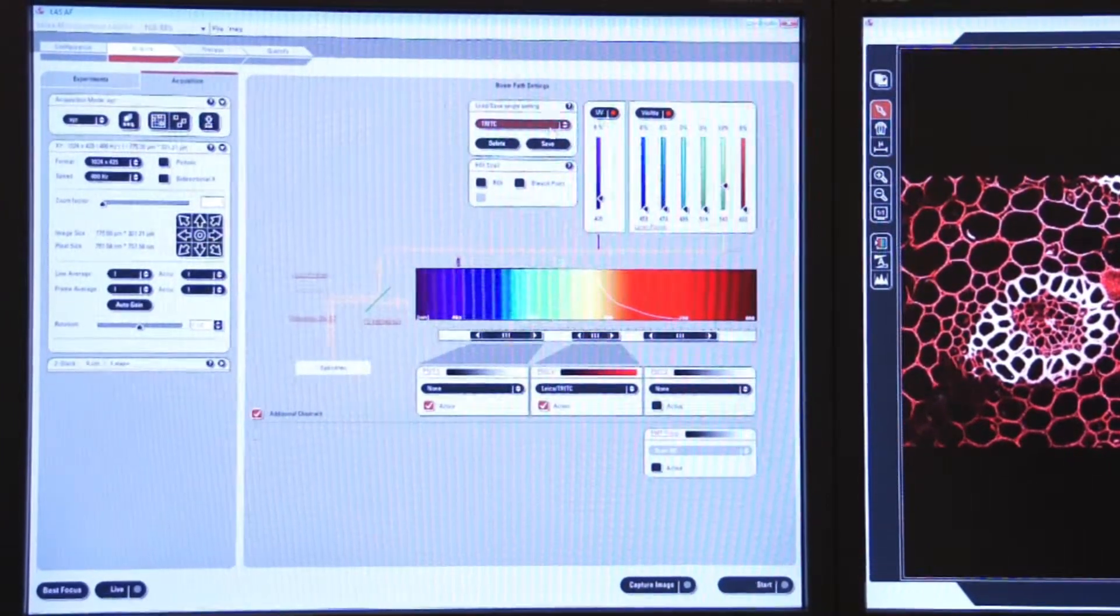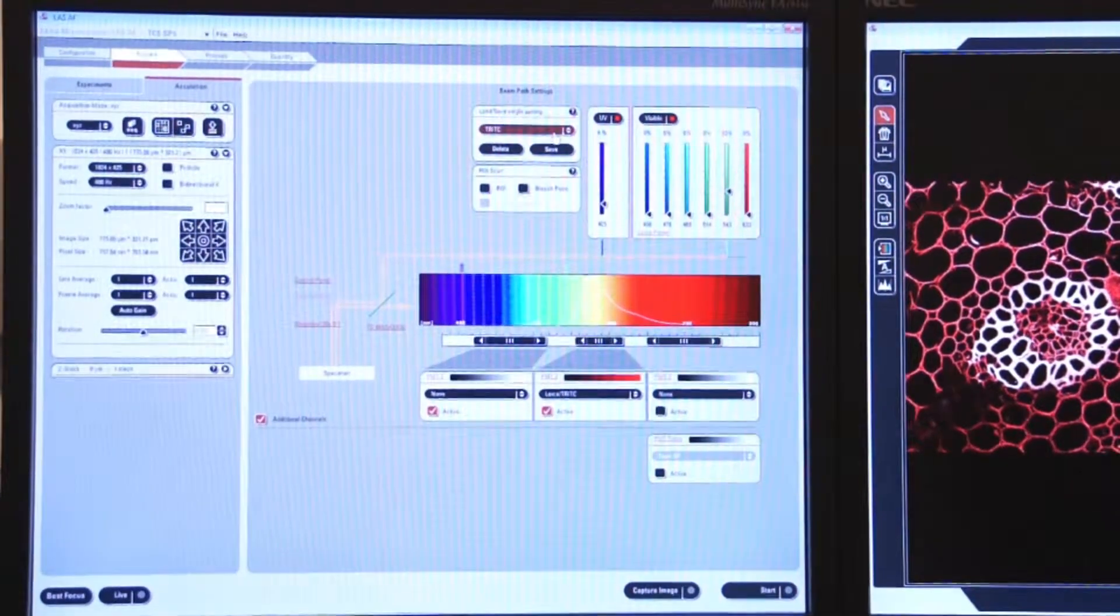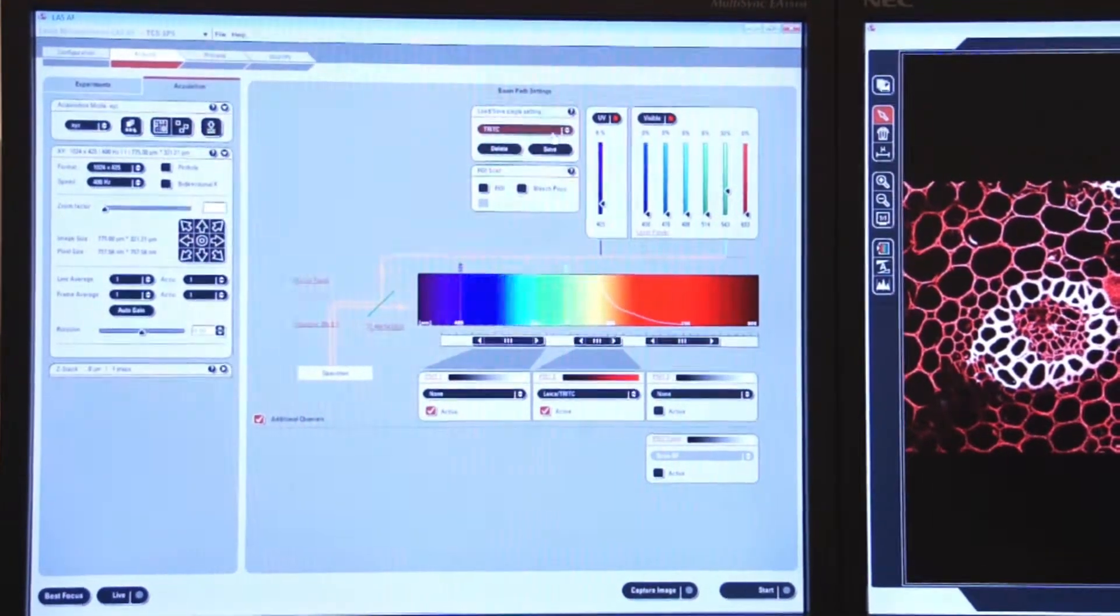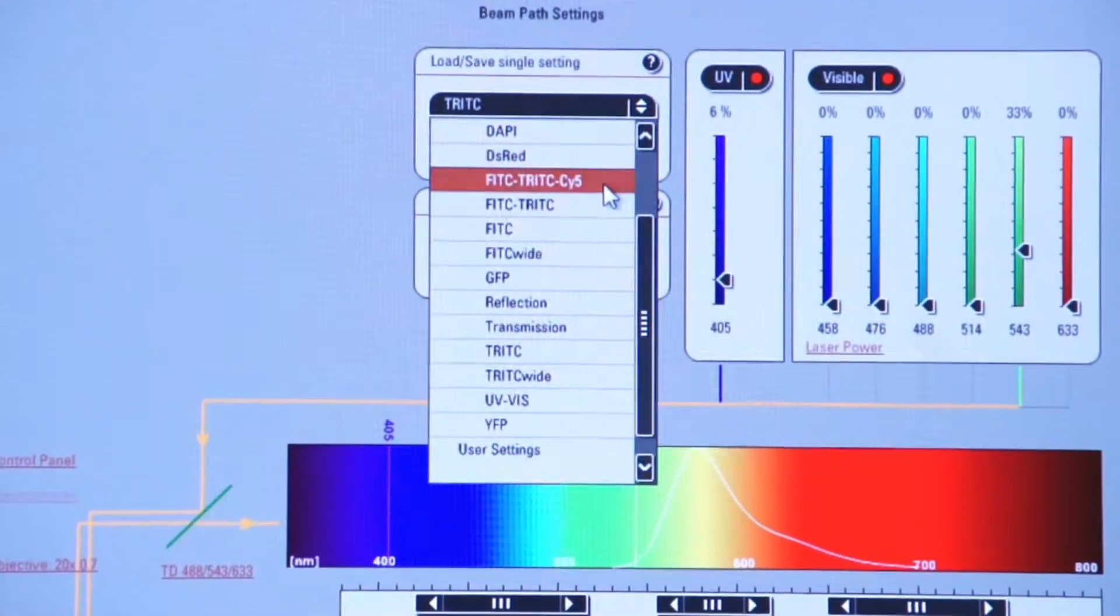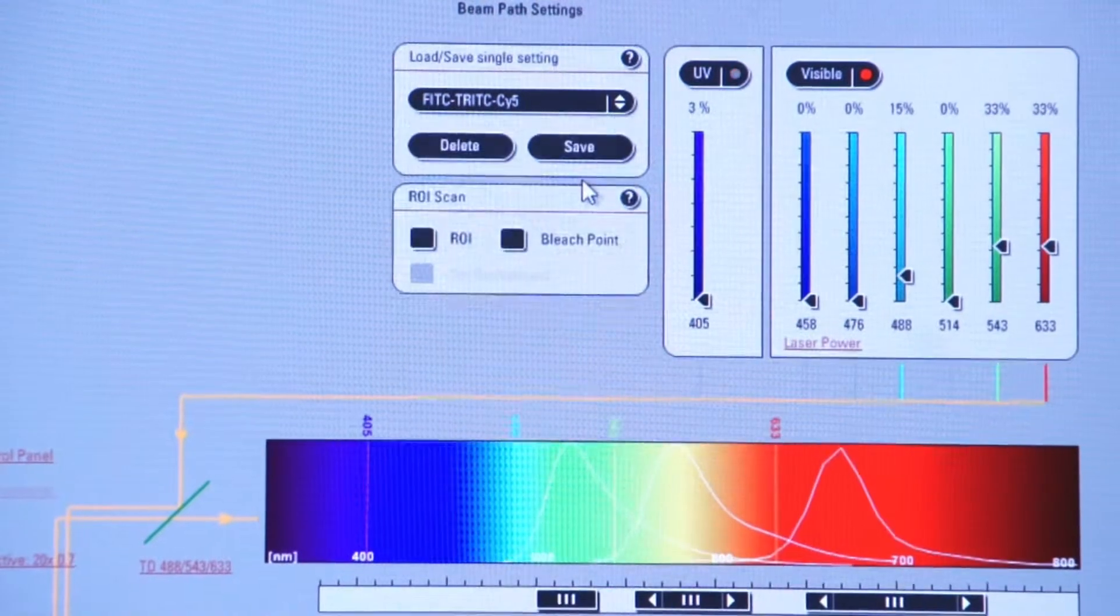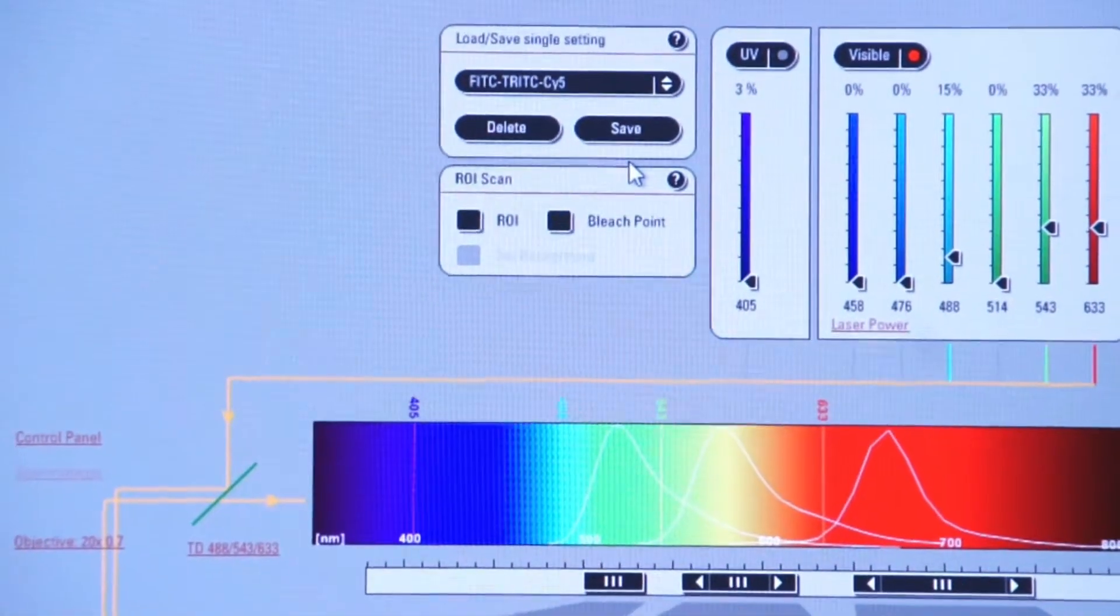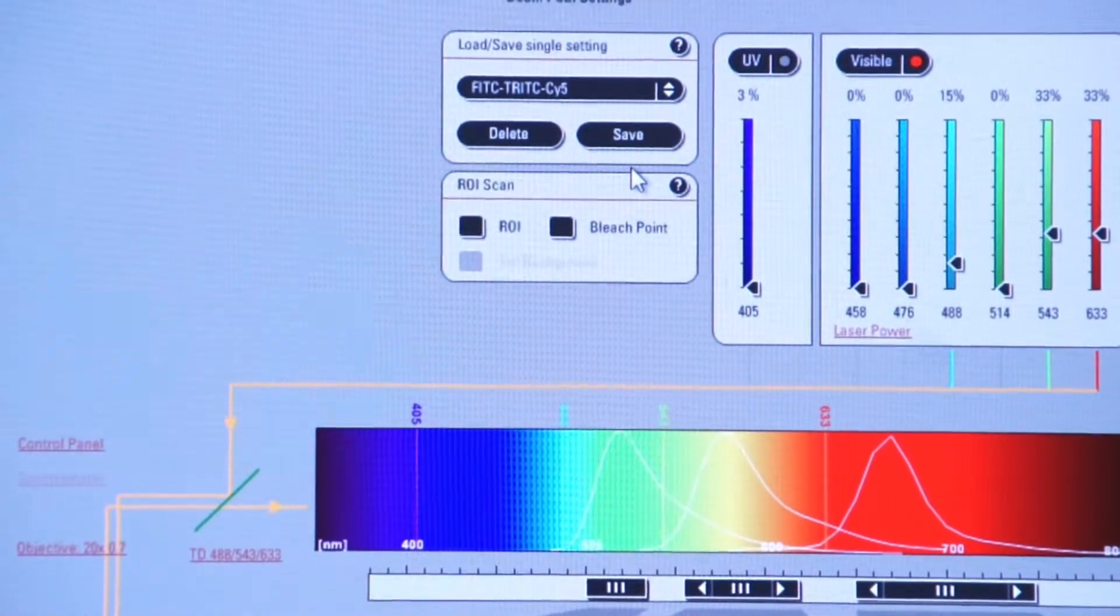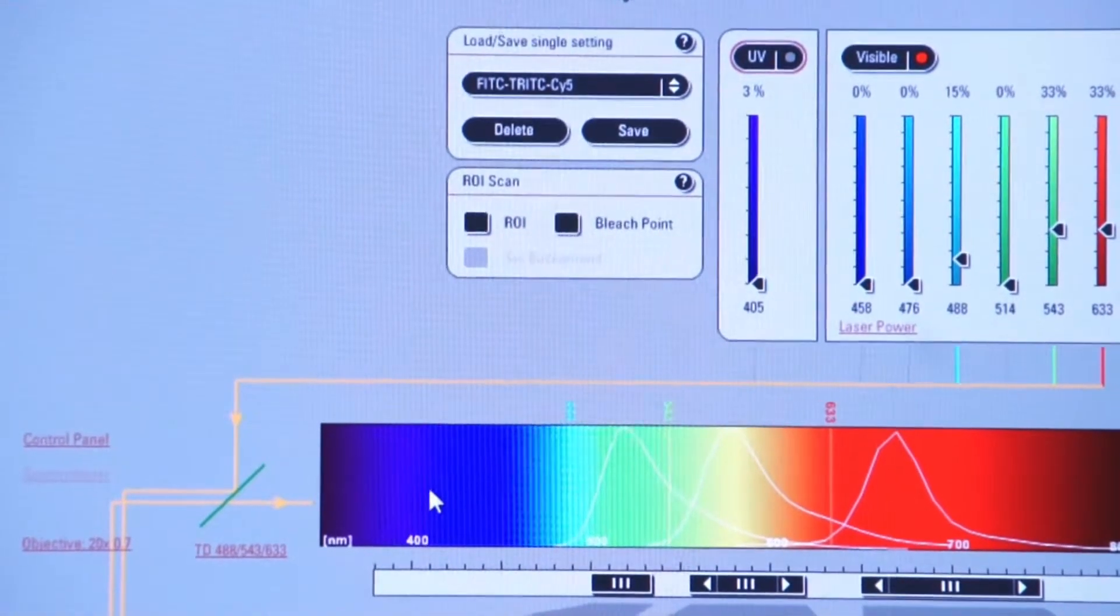Now at this time, let's select three different fluorophores and three PMTs and we'll look at our separate images. I'm going to click on the Leica settings and go to FITC, TRITC, CY5. This is now three fluorophores that we're going to be exciting based on three laser lines. I'm going to turn off the UV laser line since we don't need that.